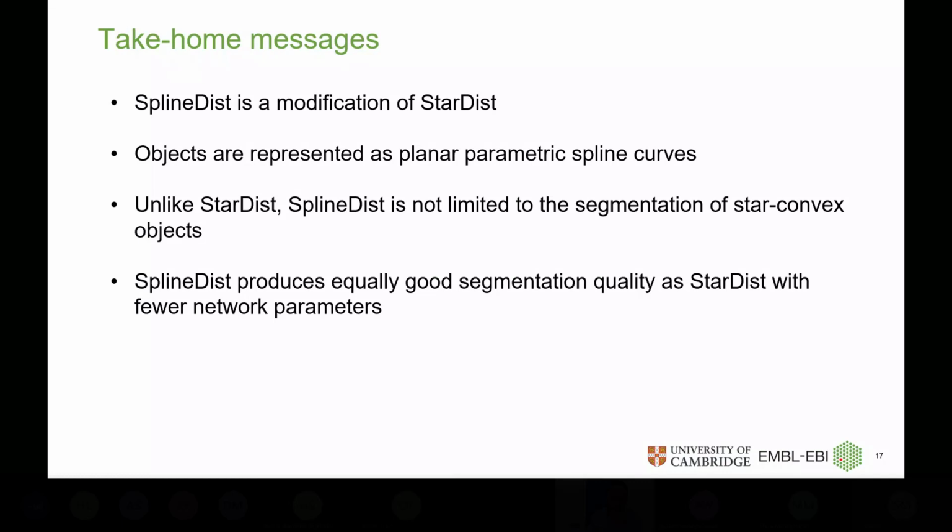And unlike StarDist, we are no longer limited by the restriction that the objects have to be star-convex. And you can also see that SplineDist manages to produce equally good segmentation results with fewer network parameters, irrespective of what kind of objects the dataset contains.